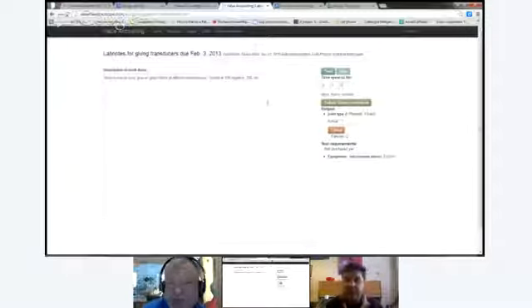And then Francois comes and he's market oriented, looking at the market, and he can search the system and say, oh yeah, there's this guy doing R&D on that, and his goal is to improve this process. Then he can potentially put R&D projects together and orient them towards a common goal, which is, okay guys, now let's all work together to make this particular product. You see what I'm saying? So I think it's good to have visibility into the intentions or the goals of R&D projects.